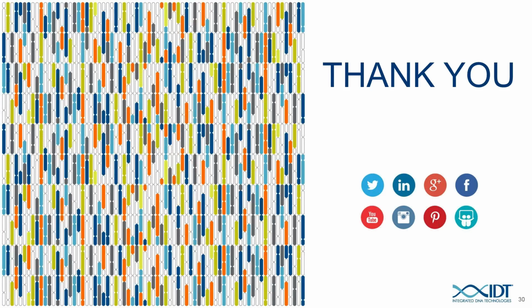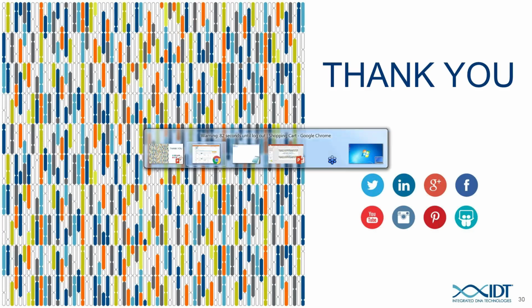Okay, you actually jumped ahead to my other question about storing the RNP, so that was great. The next thing that I have here for you, Justin, is a couple of questions about the design tools that you showed. So in the MIT design tool, do you know why there are two different zebrafish genome options?